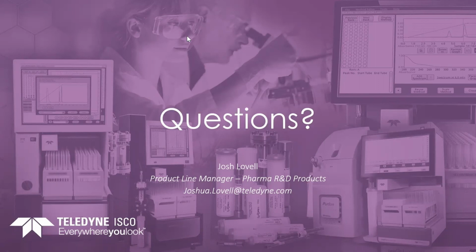So one of the first questions is, if we're doing multiple injections sequentially on a column, do you need to wash the column prior to each new injection? And this kind of depends on the separation. If you have a fairly clean product you're putting on there and you're purifying maybe 2 or 3 materials and nothing's being retained on the column, then you probably don't need to do a wash step every time. You may need to do a wash step every 5 or 10 runs or something like that. And that's all going to be compound dependent and sample dependent.